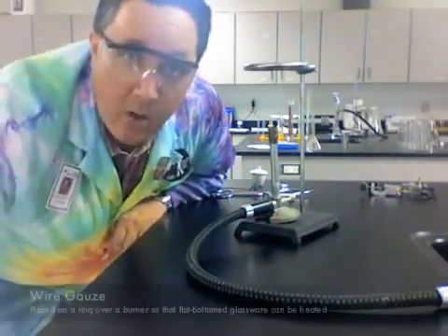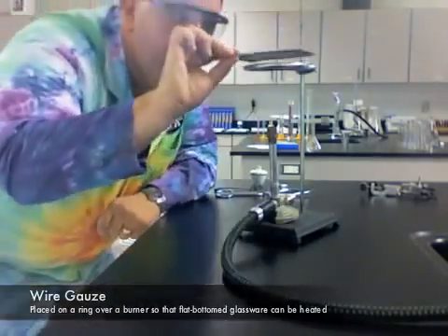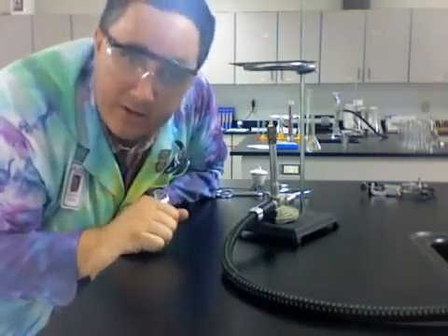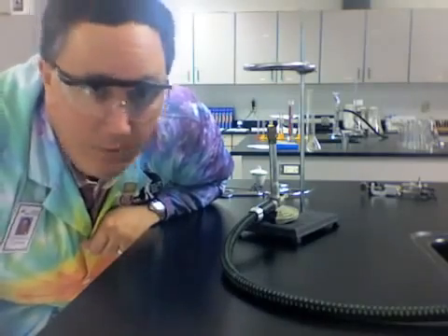You can use wire gauze. Wire gauze has a heat-resistant material here in the center. When we put it on the ring, now we can set flat-bottom things like beakers and Erlenmeyer flasks on the wire gauze. What if what you're going to use on the ring stand doesn't have a flat bottom?